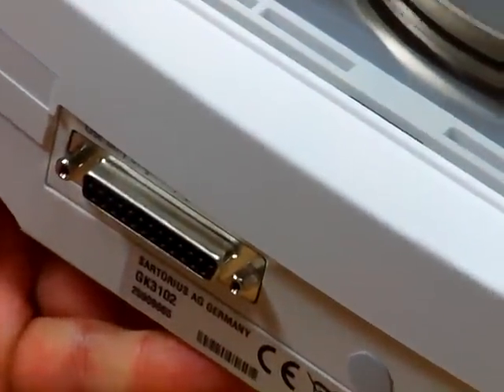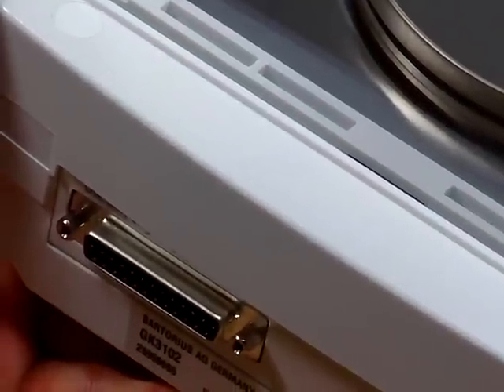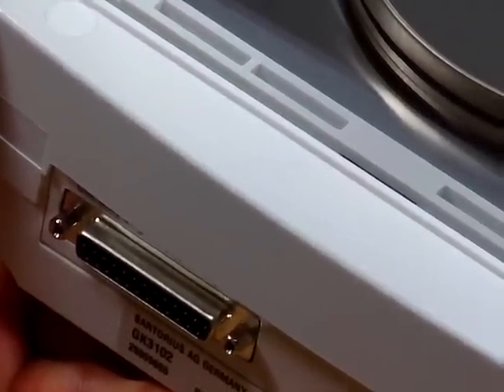We also have an RS-232 interface for integration into a computer system. You would need to purchase the Sartorius cable and have your own software, or you could buy the WinWedge software.